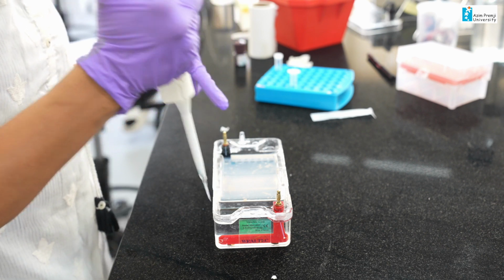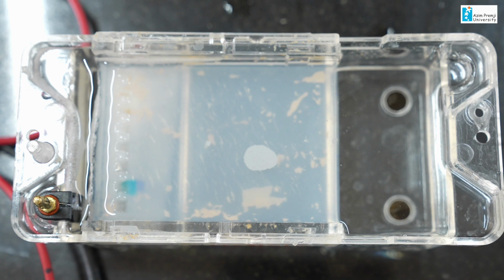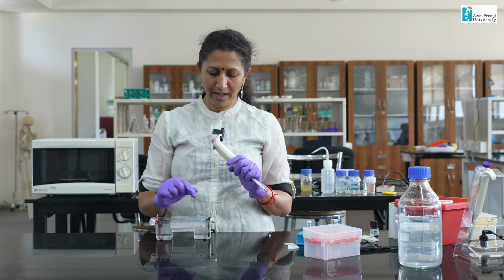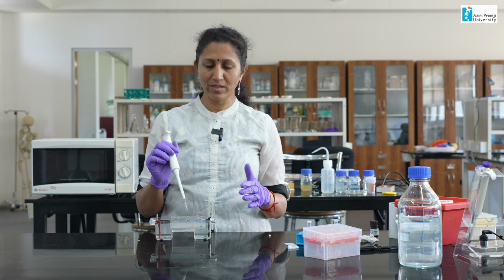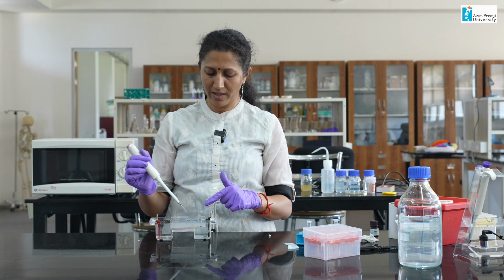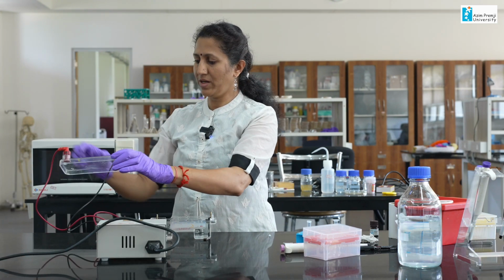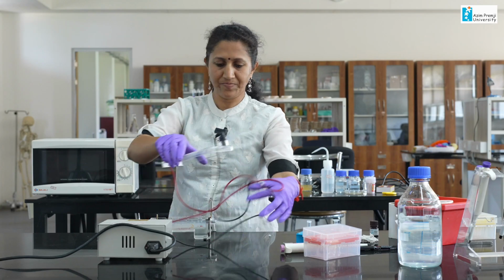Now, after running, in the well where I have loaded the ladder, you get bands of different fragments of known length, and in the other one where I have loaded the PCR sample, you may get an amplified band, but you will not know the length. But by comparing with the known DNA bands in the other well, you can say that yes, this is your amplified product. So, now I have completed loading the DNA sample and the ladder.